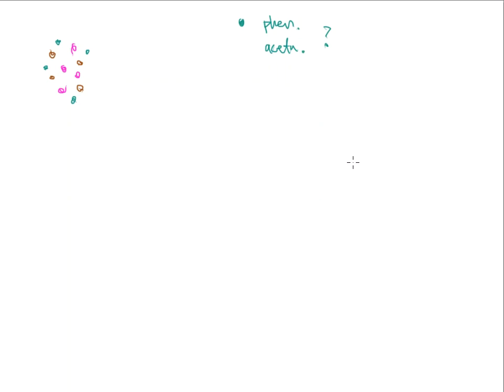Well, here's the thing. I know that these two have different melting points. Hey, if I can do a melting point, I can determine which one it is and maybe feel good about it. The problem is that if I take the sample as it's given to me, I can't do a melting point on that because it's a mixture. There's more than one thing that's present. And if I do it, it's not going to make any sense.